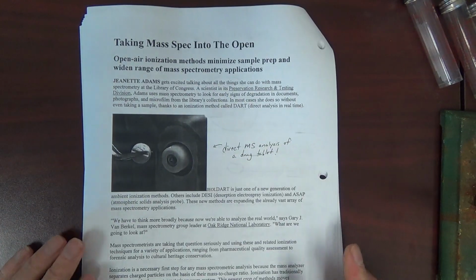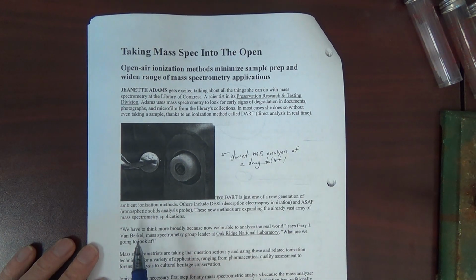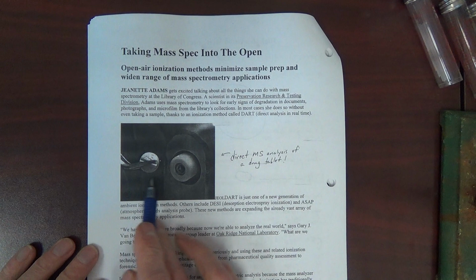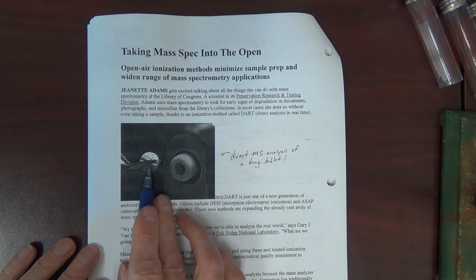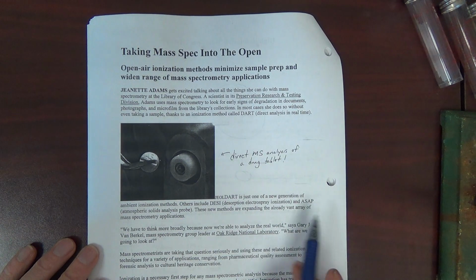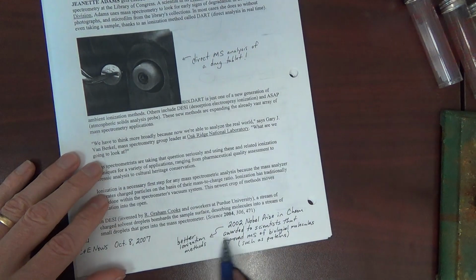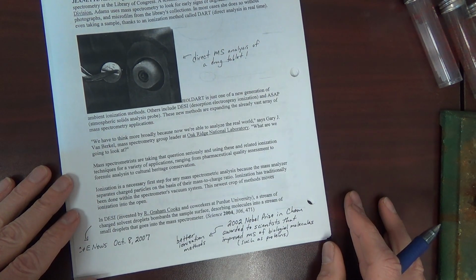Okay, this is interesting. In the past 10 or 20 years, instead of only injecting solutions into a mass spec instrument, we now have so-called direct analysis, and this is a picture of just holding a pill up to the mass spec port, and molecules are pulled off of the pill, and we can get a mass spec here. 2002 Nobel Prize for better ionization methods.